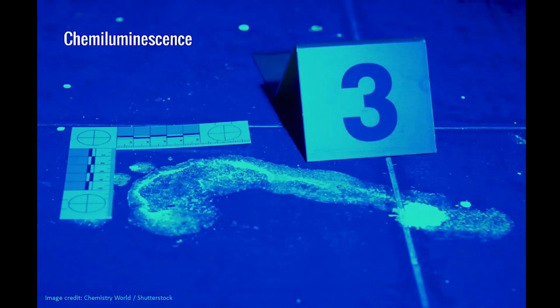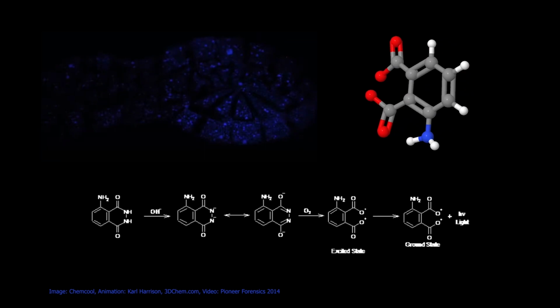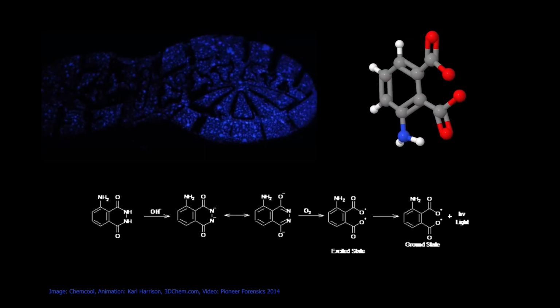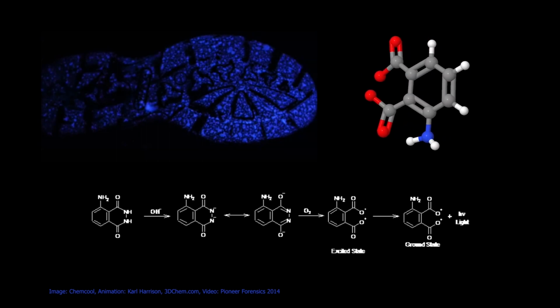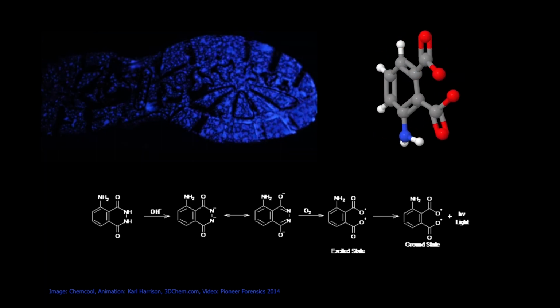Chemiluminescence is used by chemists when undertaking forensic work at crime scenes. Usually, a mixture of luminol and hydrogen peroxide is used. In the presence of heme, as in the heme in haemoglobin in our blood, a glowing blue colour is seen. Unfortunately, it is sensitive to oxidising contaminants, such as those found in household bleach. In fact, I'm using bleach here to make the luminol glow.